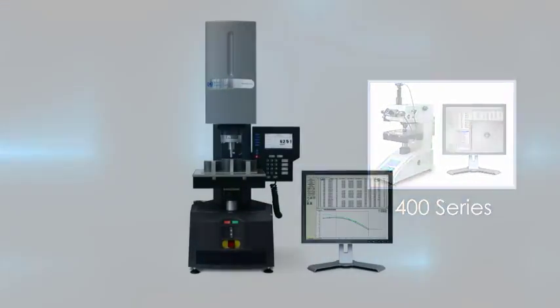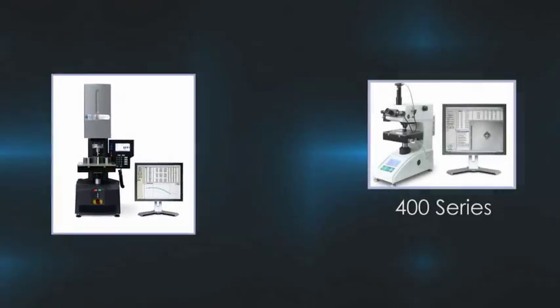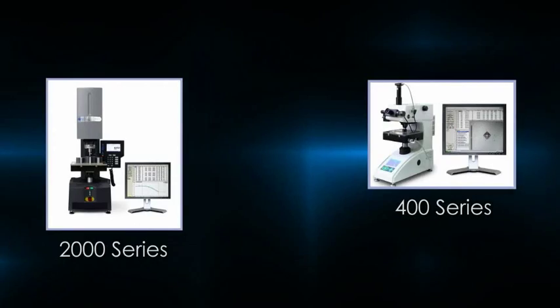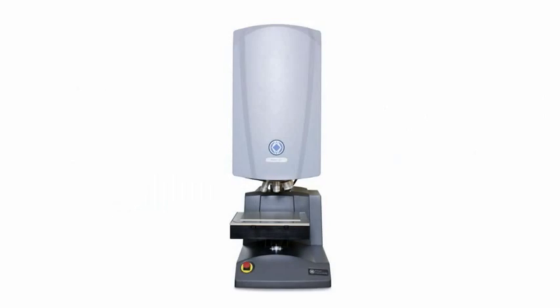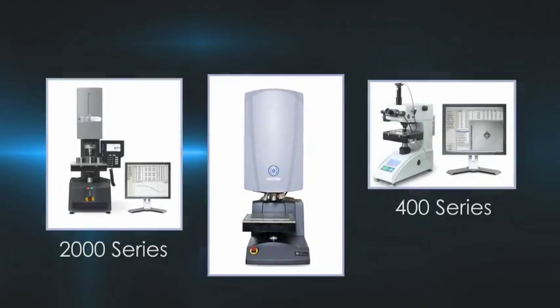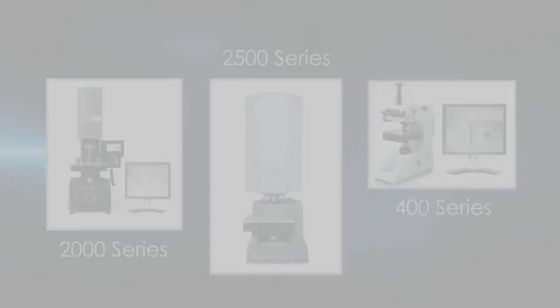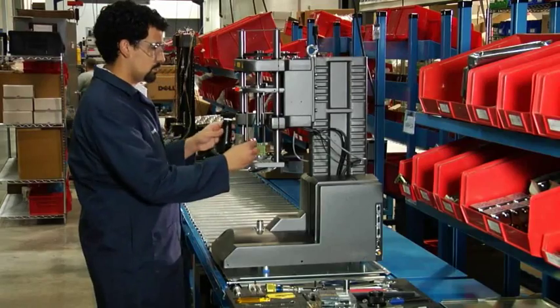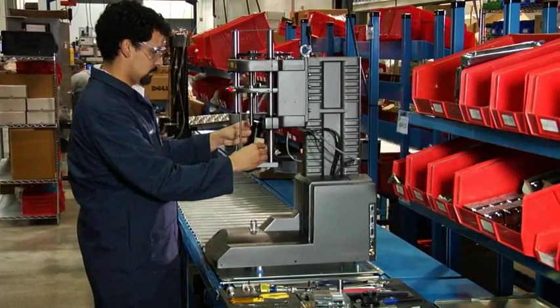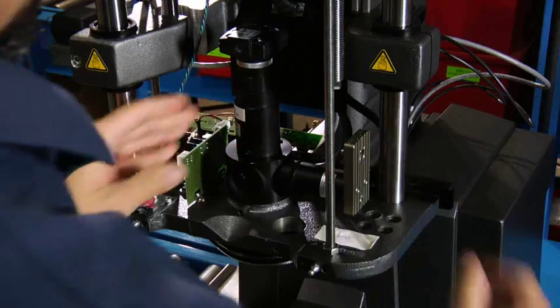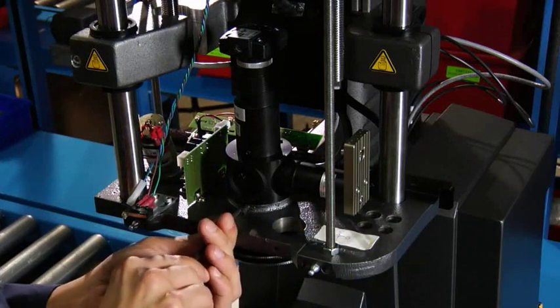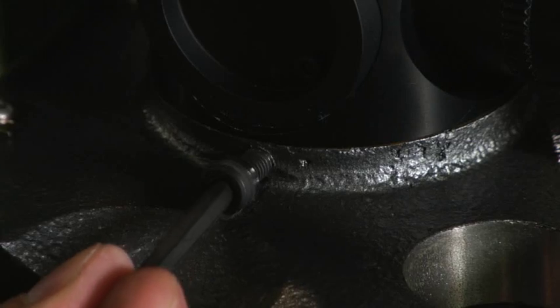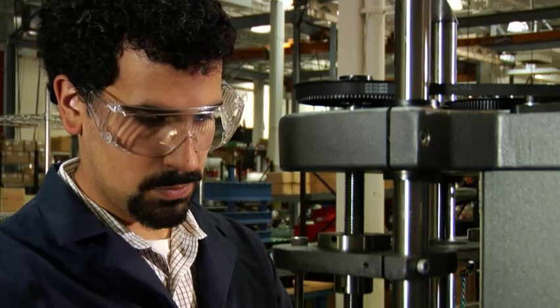The Minuteman automation software can be utilized with various Wilson hardness testers to provide a solution designed to meet your application. All of our automation testers and software are 100% designed, manufactured, supported, and serviced by Wilson hardness.